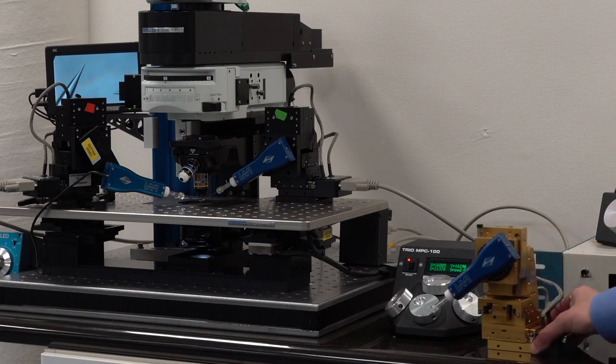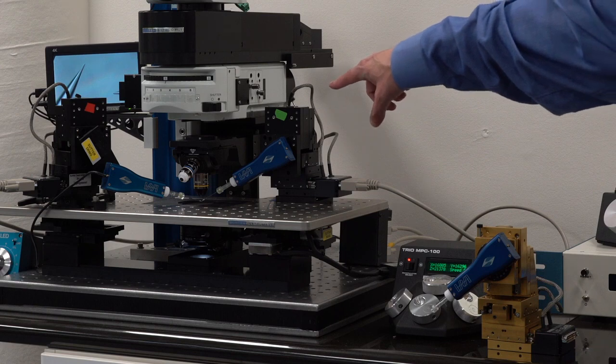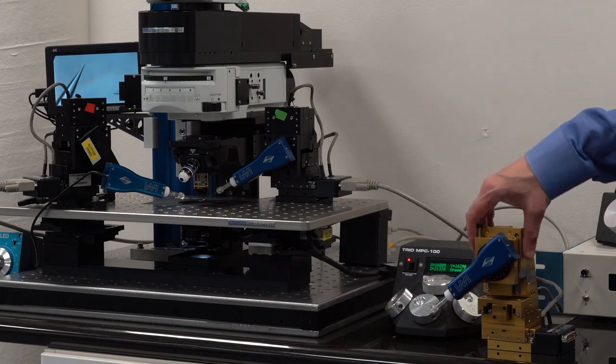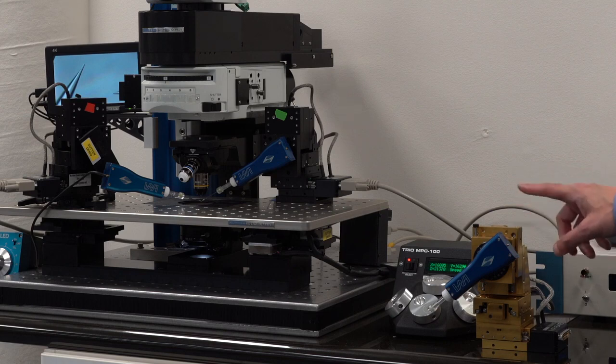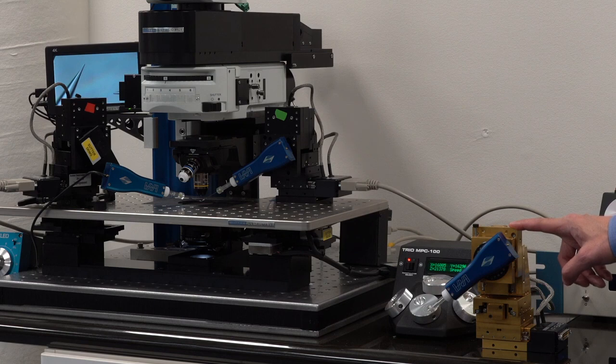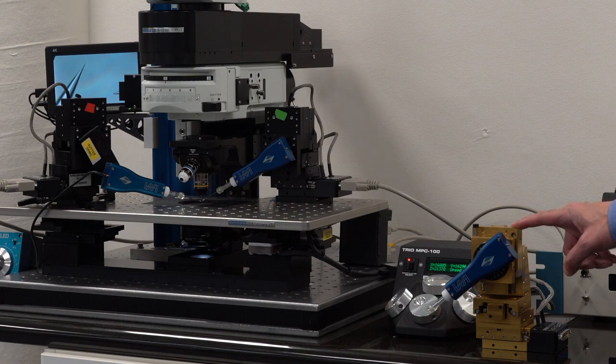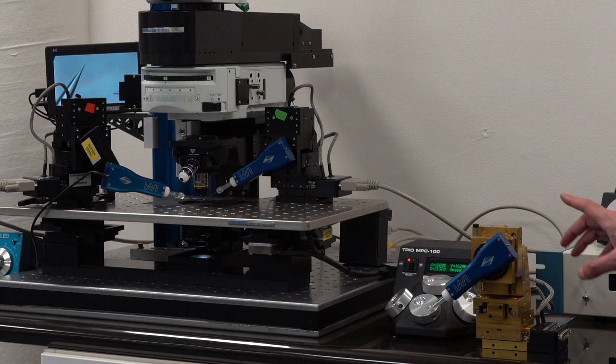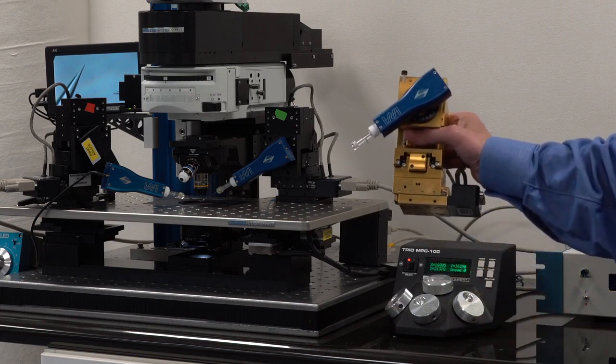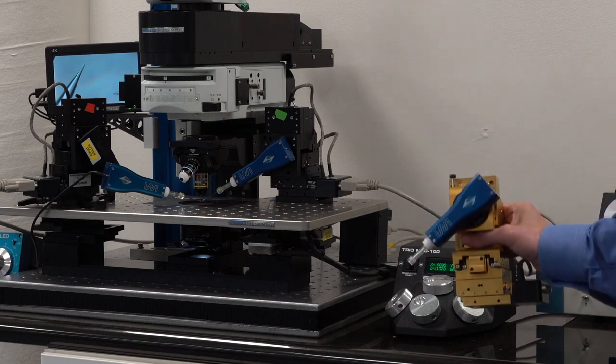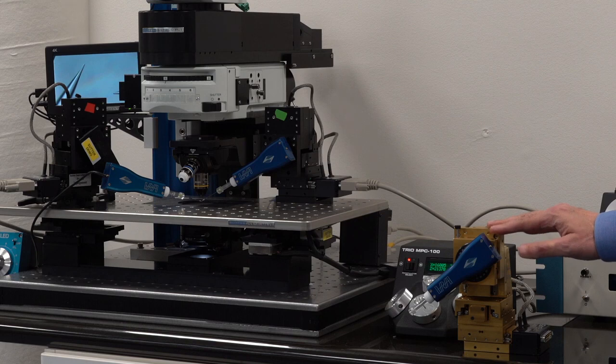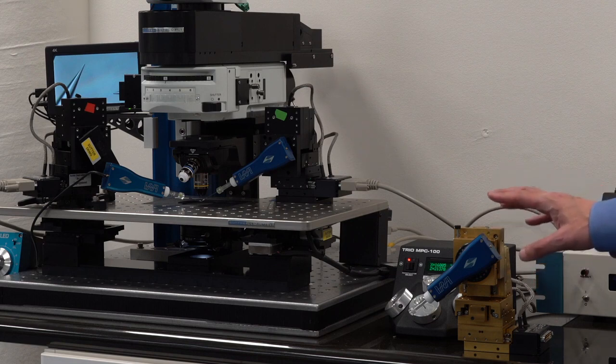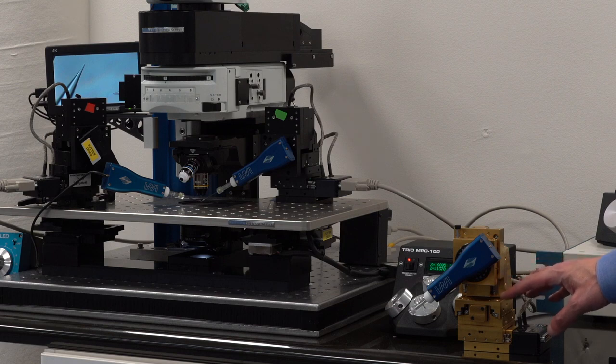Now, for thermal stability, we have made the same trio 845 out of stainless steel. This is not made out of gold, but it is made out of stainless steel. The reason for the gold color here is titanium nitrite used to coat these stainless steel parts. This is the same coating they use for stuff like drill bits so they don't rust. It is very heavy. I wish you were here so you can feel how heavy it is as compared to the aluminum ones. It is thermally more stable because stainless steel has a better expansion coefficient as compared to aluminum.